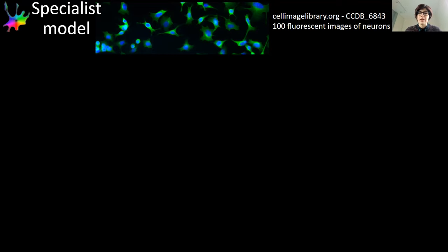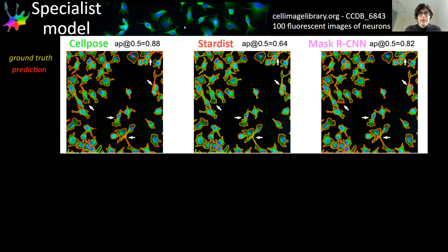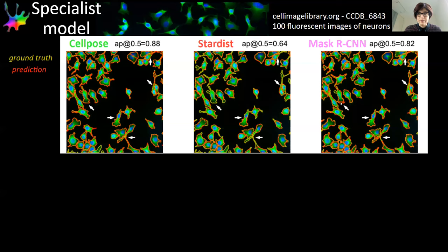We tested this algorithm on specialized data: 100 fluorescent images of neurons from the Cell Image Library that were pre-labeled. We trained CellPose, StarDist, and Mask RCNN on this data. Compared to StarDist, CellPose more easily finds non-convex shapes. With Mask RCNN, there is often over-segmentation. Ground truth is shown in yellow and predictions in red, so errors appear where yellow and red don't line up.